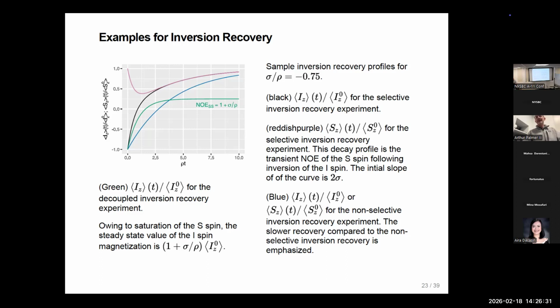And it turns out that the deuteration at the alpha position is quite high, but not so high at the methyls. So there's still some methyl proton magnetization around. And usually we're happy with that, because that means if we saturate the nitrogen and the amide hydrogens, there are methyls around to help spin flip and get recovery to Boltzmann equilibrium. Recovery to Boltzmann equilibrium is how long it takes before we can start the next scan.